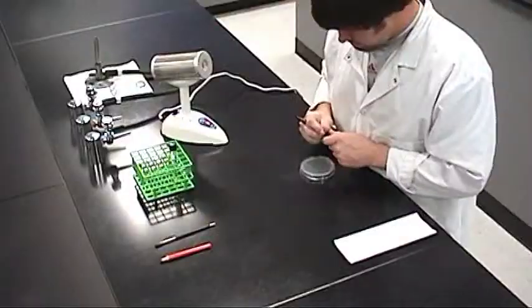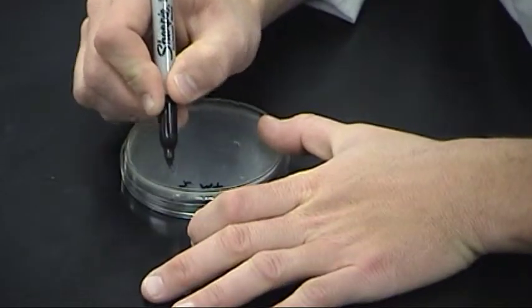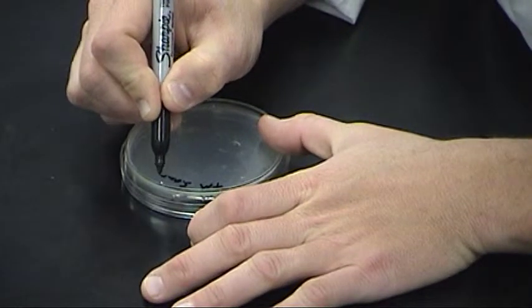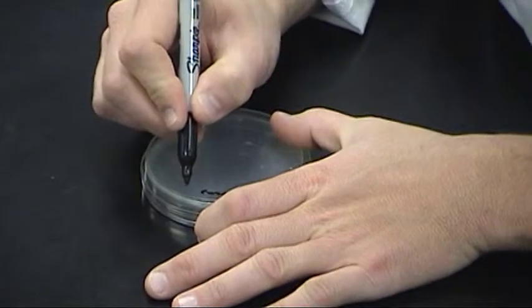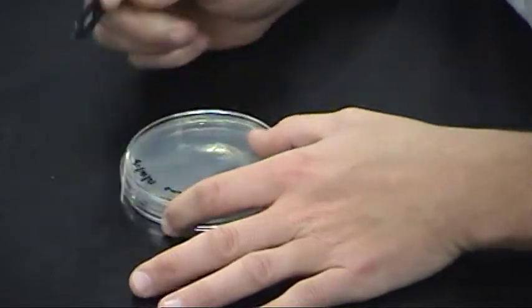First, use a marking pen to label the back of the plate with your initials, the specimen source, and the date. Print close to the edge so the label does not interfere with reading the plate after inoculation.